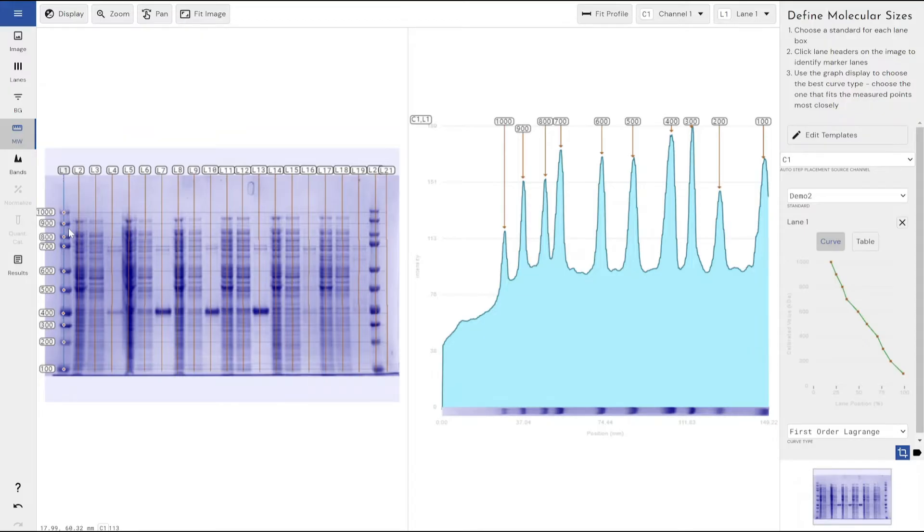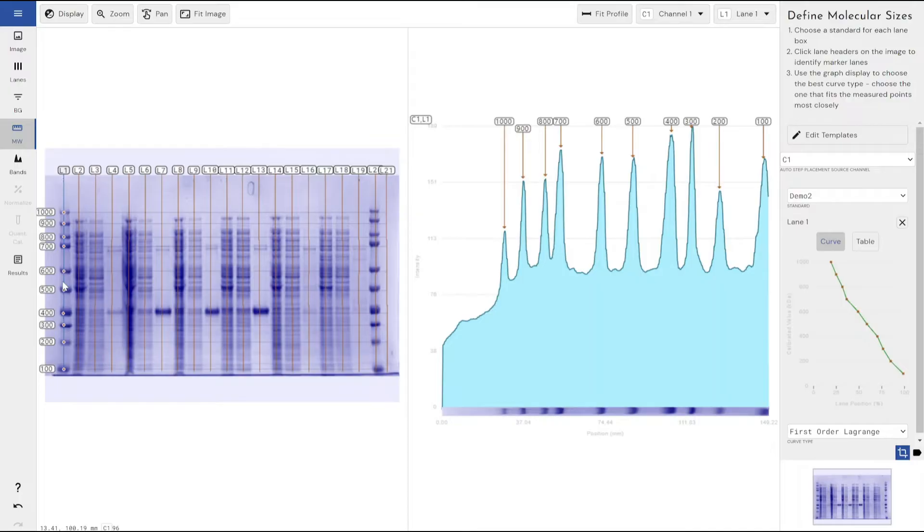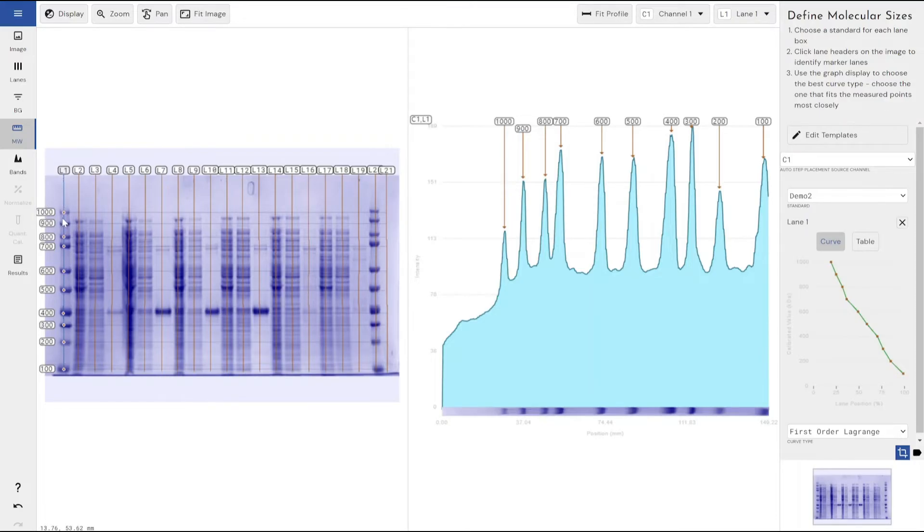What happens when I left click here is the software runs an automatic band detection which is specifically tuned to identify strong bands, because a molecular weight ladder is typically always your strongest bands that are on your gel or your blot. And you want to be able to identify those very easily based on being very strong bands.